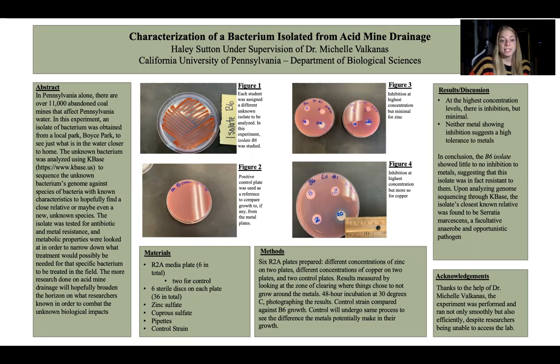The isolate was tested for antibiotic as well as metal resistance, and metabolic properties were looked at in order to narrow down what treatment would possibly be needed for this specific bacterium if treated in the field. Now, the more research that is done on these acid mine drainages would hopefully broaden the horizon on what researchers know in order to combat the unknown of biological impacts.